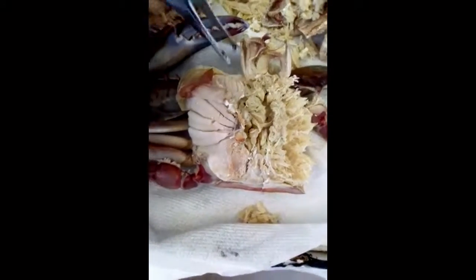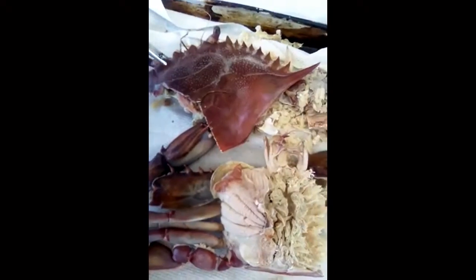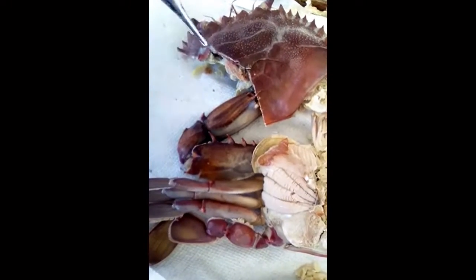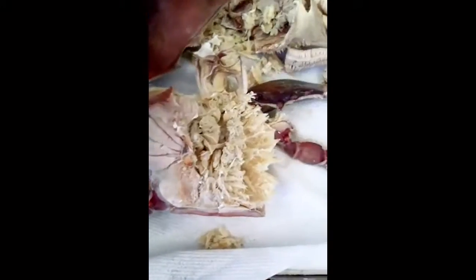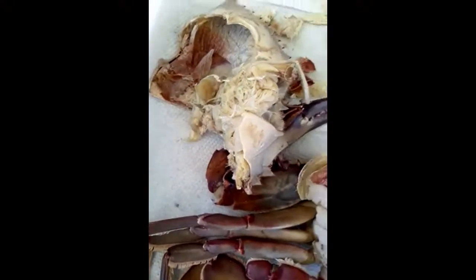Okay, so right here where the crab would eat, it would come down. If I look at the top of the head, it would come out to this side, which I took off, come down, and straight right here would be the stomach and stuff. Also under the head over here would be where the gills are, so he could stay underwater most of the time.